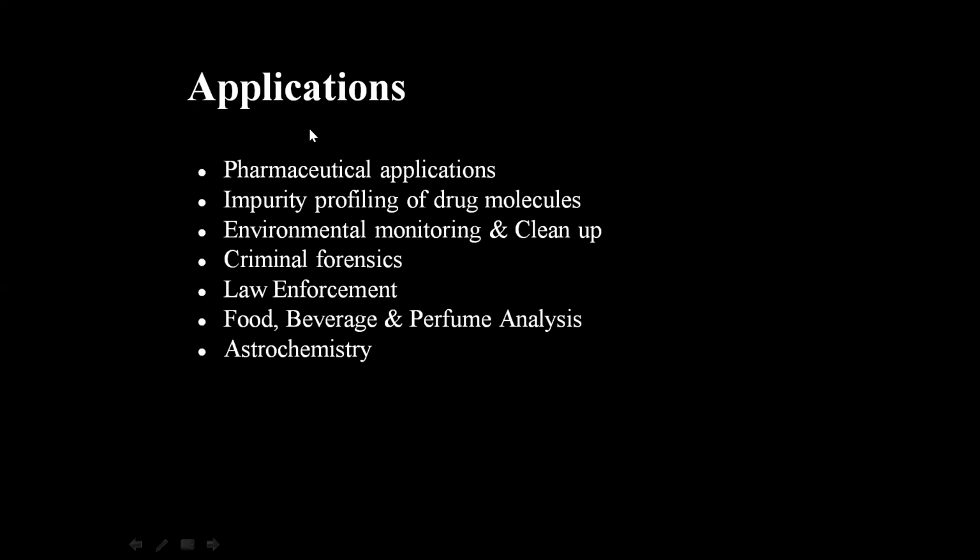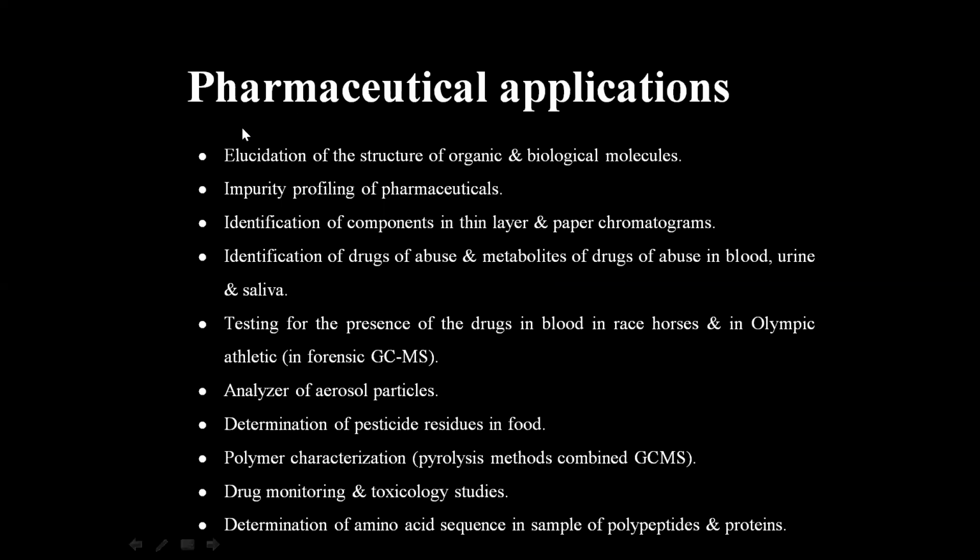What are the applications of GCMS? Applications of GCMS include pharmaceutical applications, impurity profiling of drug molecules, environmental monitoring and cleanup, criminal forensics, law enforcement, food, beverage, and perfume analysis, and astrochemistry. Next, I will explain the applications.